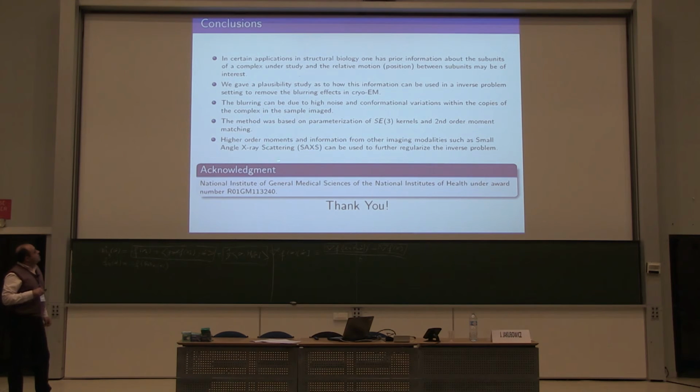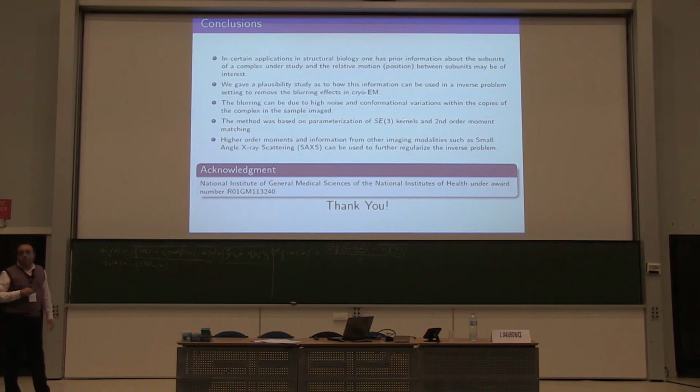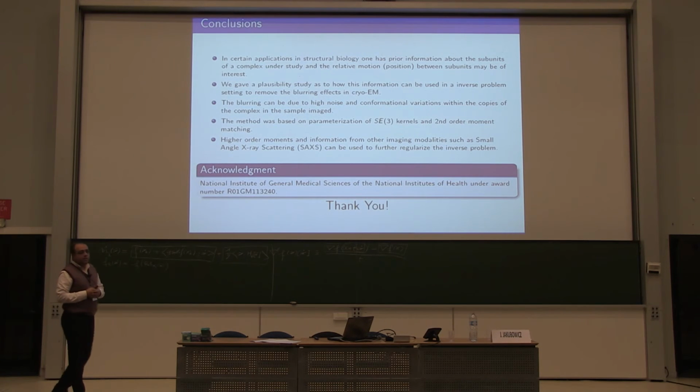think about using other modalities. For example, SAXS, or small angle X-ray scattering data, can also, from the same molecule, be used to solve this inverse problem in a better or more informed way. Thank you very much. That was the end of the talk.